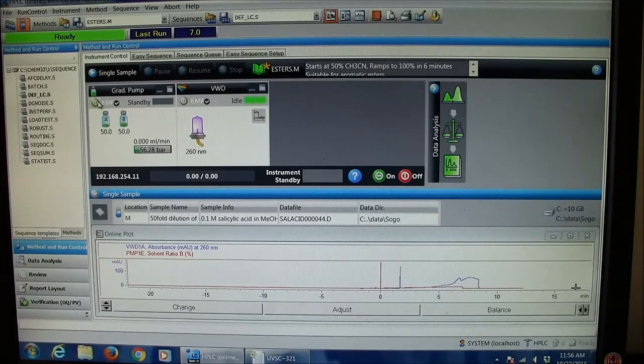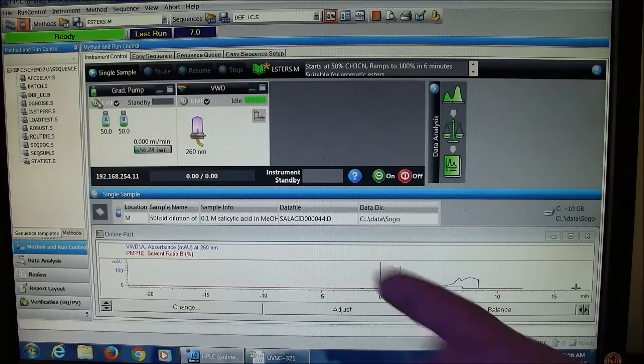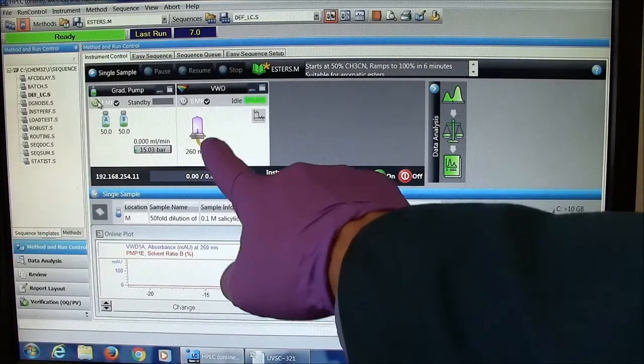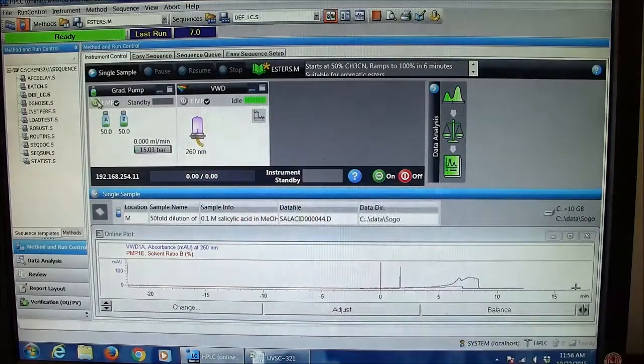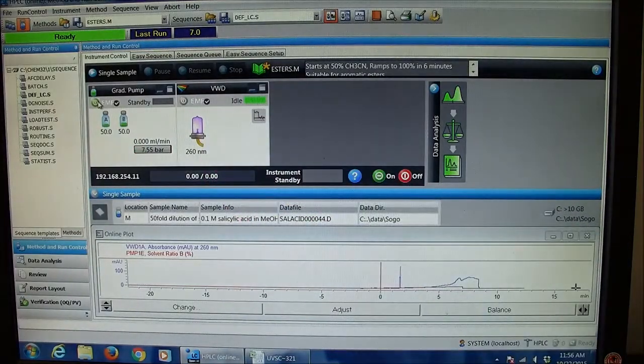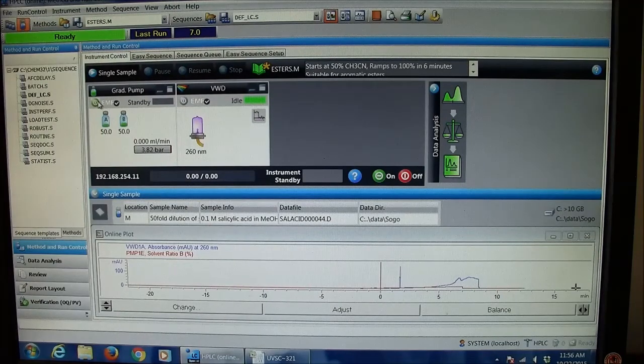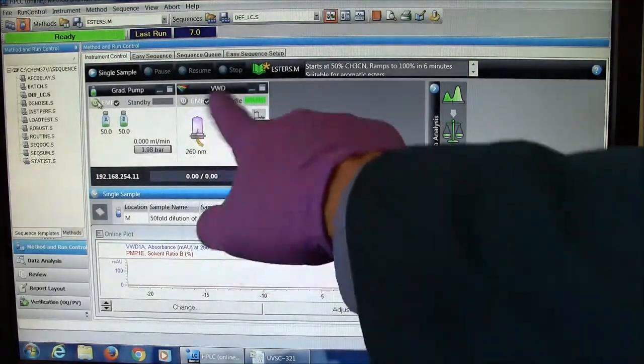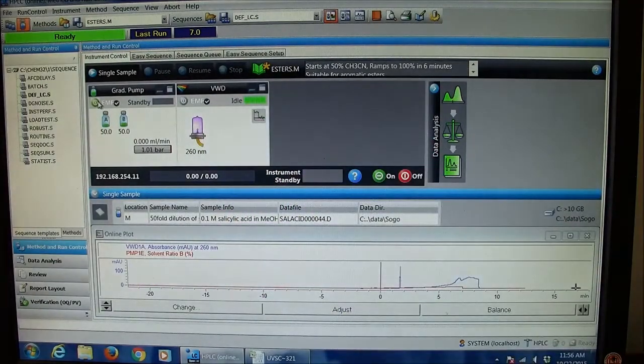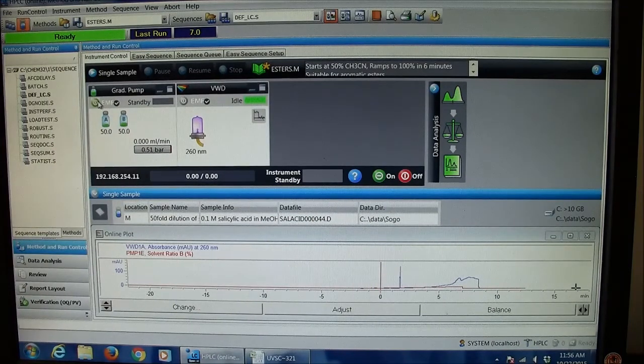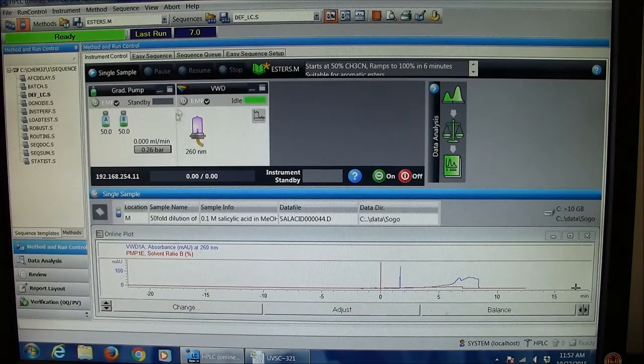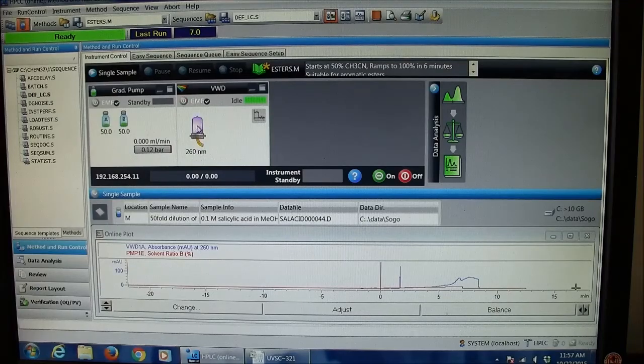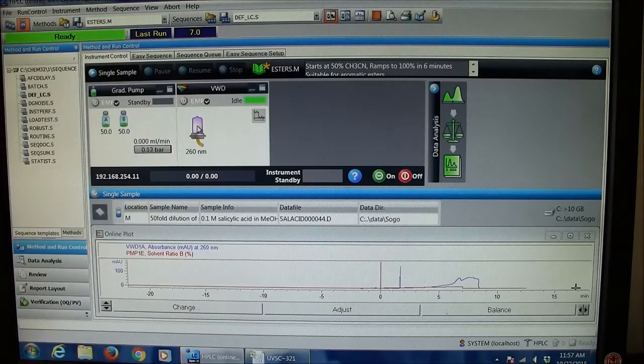If I'm the last person using the machine, I should also turn off the UV lamp. The UV lamp has a life of about a thousand hours and costs about a thousand dollars, so every hour it's on is a dollar. To turn it off, I can either just click this button or do a right click.